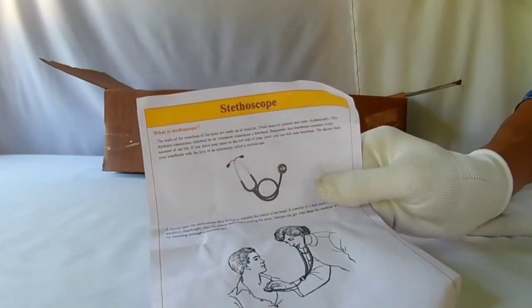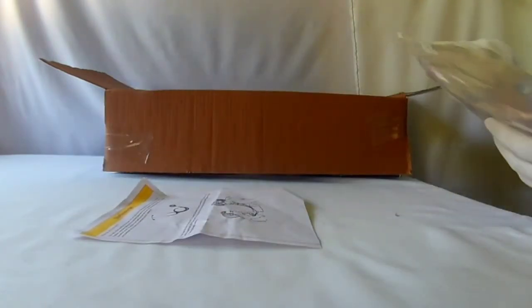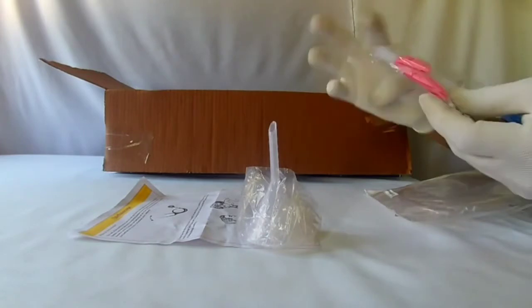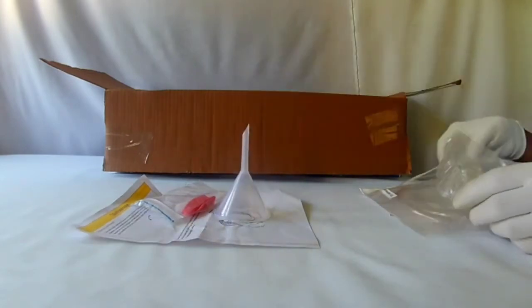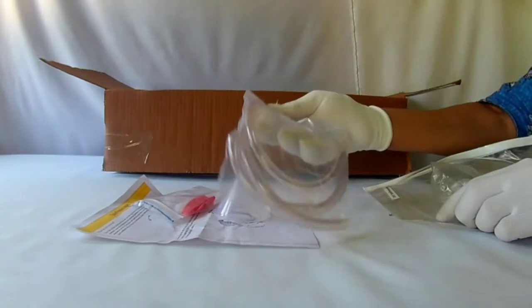Stethoscope. Wow, used to find the number of heartbeats. A plastic funnel. Y tube and a balloon. Some pipes.